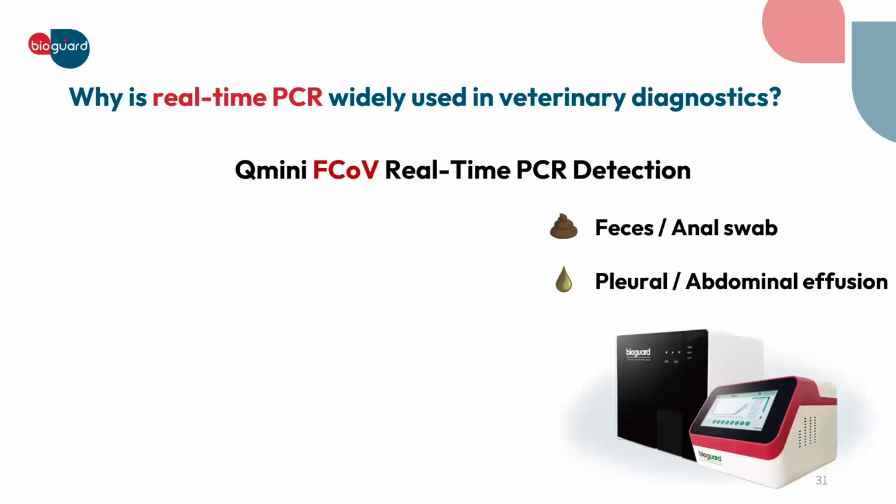Yeah, but still, why is real-time PCR the most trusted method so far, or chosen, I would say, by veterinary clinics.